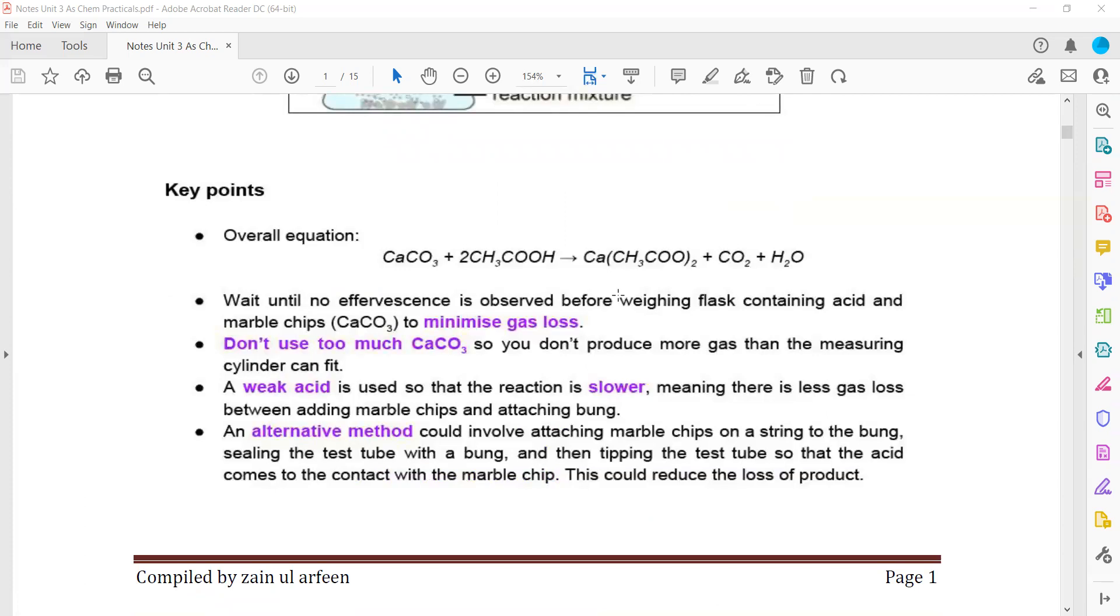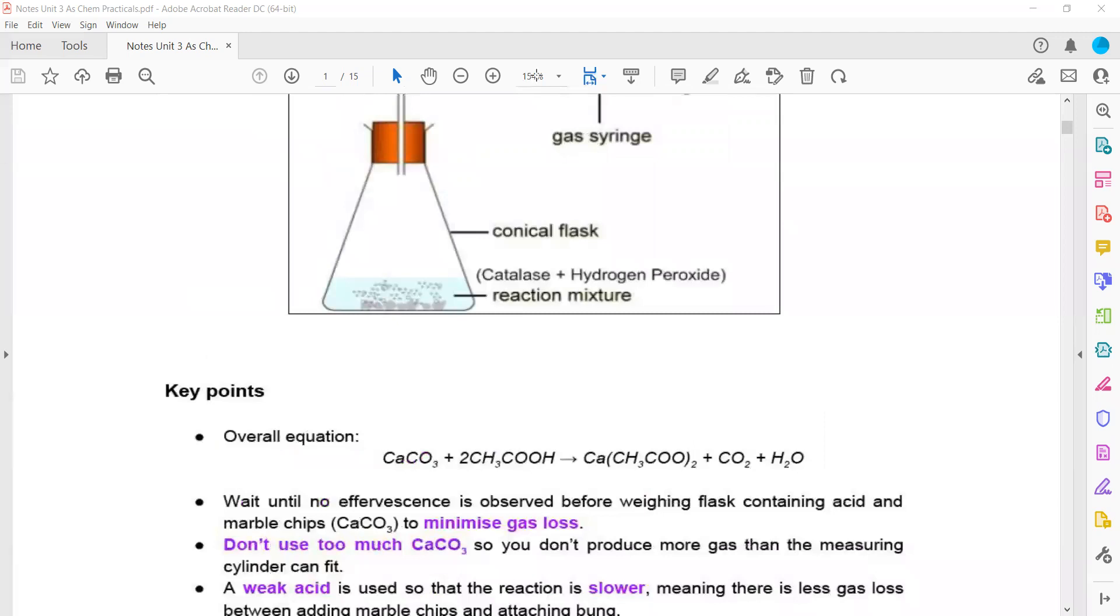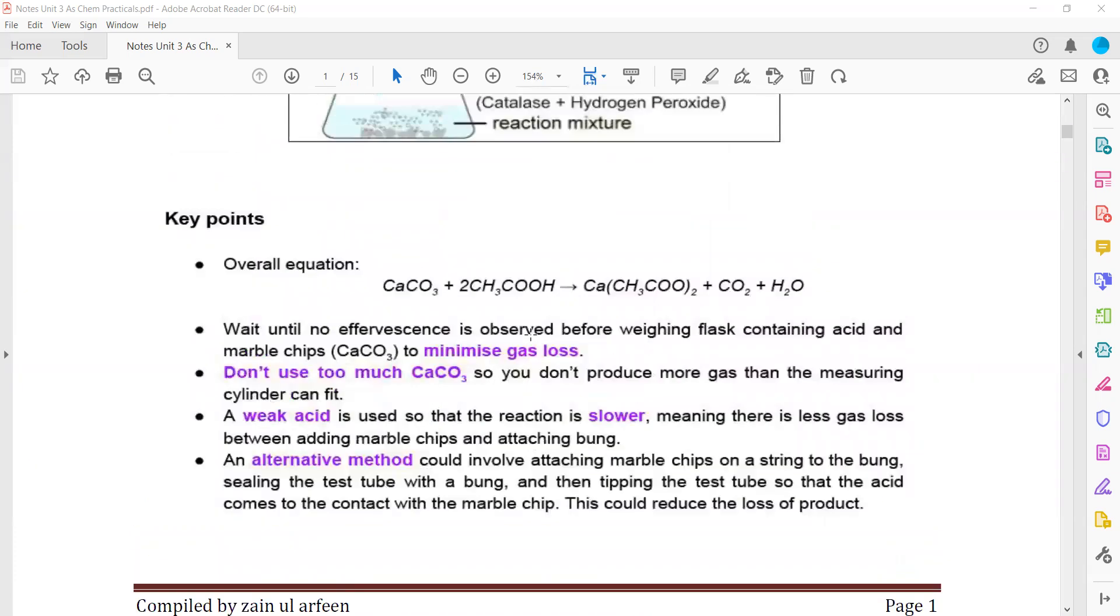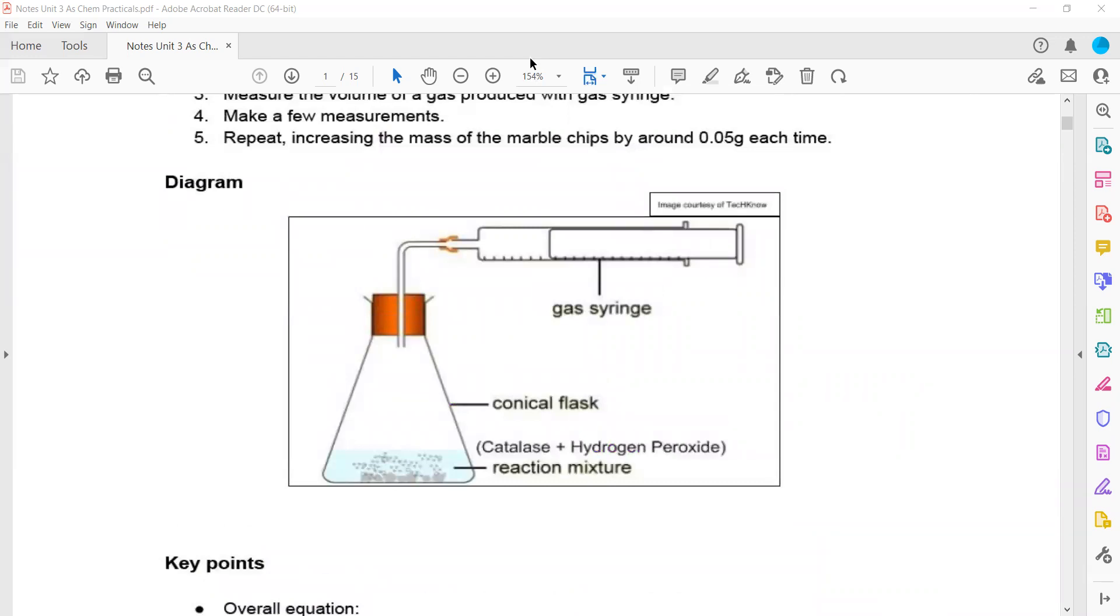An alternative method is attaching marble chips to a string in the bung. Place the bung initially with a test tube containing the marble chips inside, connected by cotton wool or thread. When you remove the thread, it enters the flask and the reaction occurs. You can also use a tap funnel to add the acid, which minimizes gas loss.